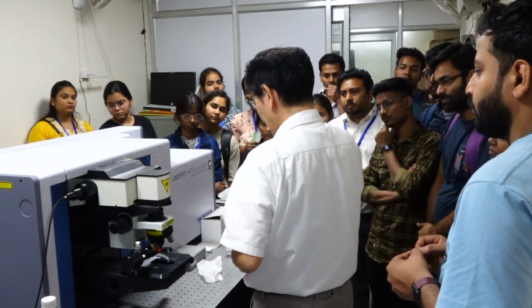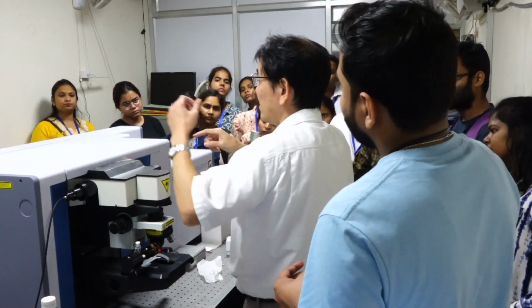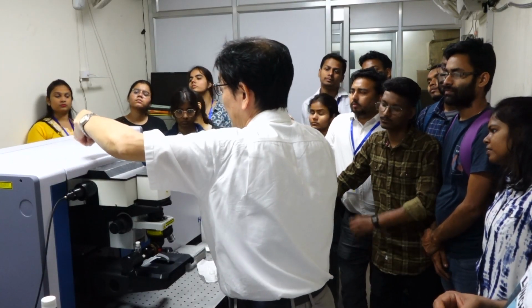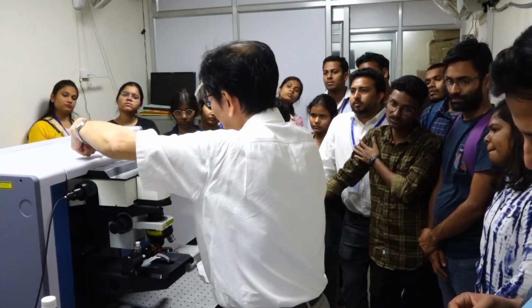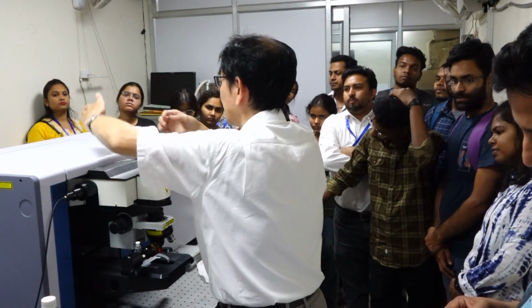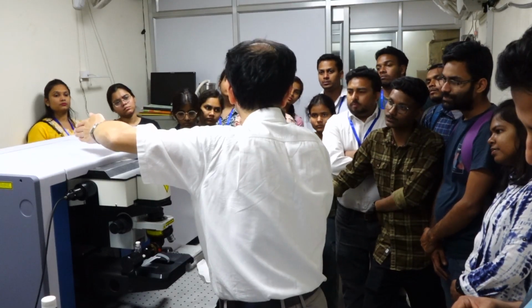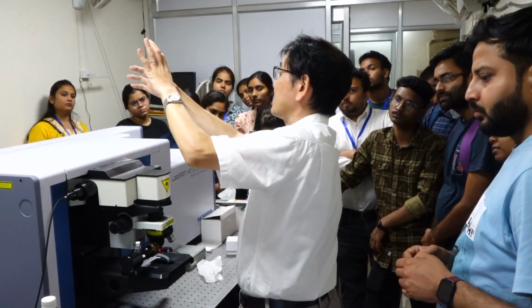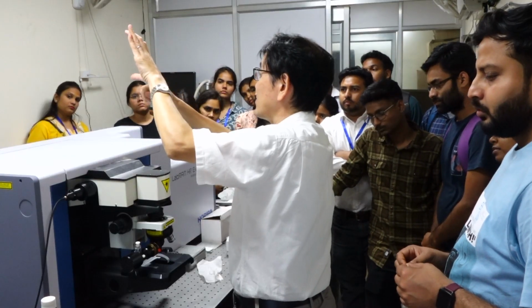Okay. Then backscattering comes back to the box. Laser line excitation beam comes from this side, and the beam, including Raman signal, goes back. How can they separate it? We put one optical element here. That is dichroic mirror, two-color mirror. When I express a spectrum, the vertical axis is transmittance, horizontal axis wavelength.